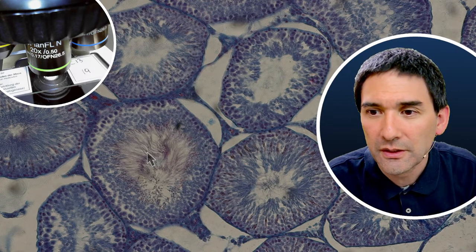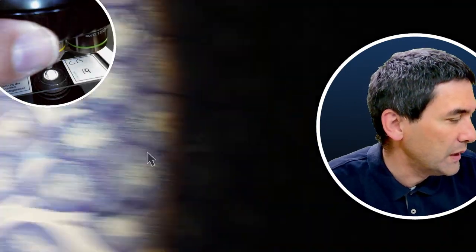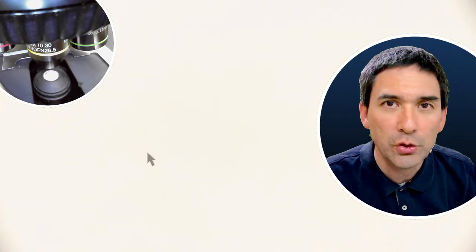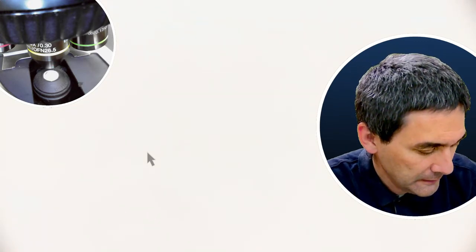So this is, I think, one of the reasons why many of the slides that can be used for teaching, even though you're teaching the human body, very often you're using slides of other animals because they also work. Here, this is an interesting one. It says the artery and vein of a mammal, and it does not specify which mammal it is.